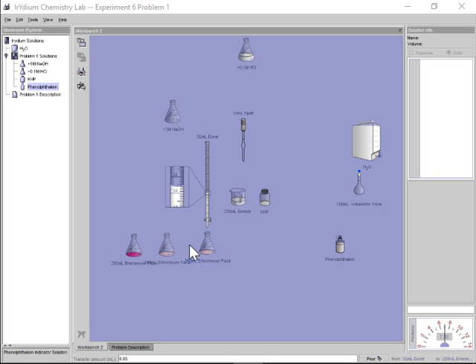For titration, the whole point is we want to hopefully have at least 2 trials, if not all 3, hitting pretty close to the same volume reading before we do our stoichiometry. In the past, chemists used to pipette by mouth. Instead of having a suction bulb, they would literally, like a straw, put their mouth on this end. You can imagine, whoops, if I suck up too much, then you just drank your solution. Totally not a good safety procedure.